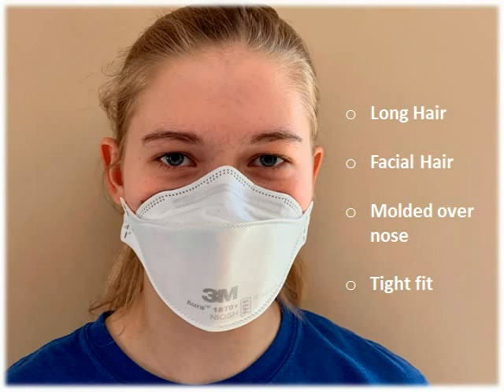Be sure that hair is not trapped under the mask. The mask must be molded over the nose to assure a tight fit. Gently push down both sides of the nose piece at the same time to promote a tight fit. Bottom line, it is imperative that the respirator fit tightly to assure that infectious airborne agents are not inhaled around the mask into the mouth and lungs of the healthcare worker.